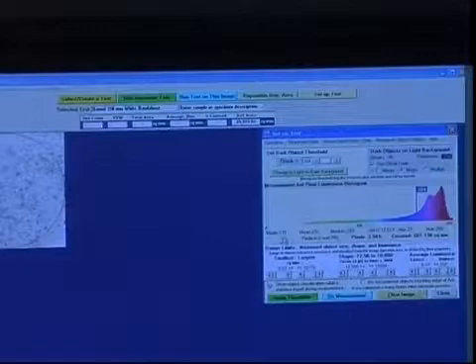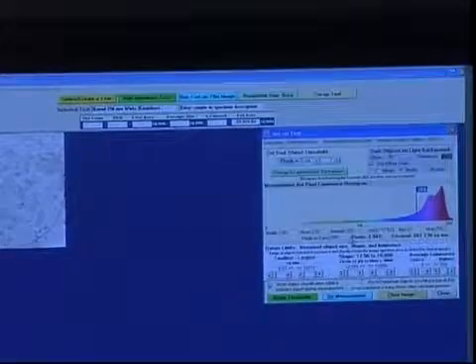And we will then set up the test further by designing the actual threshold. So you can see here that we have a threshold set of -35, about 15% of the background as suggested by TAPPI, and that is a threshold of 204. And we measured the background. We got the statistical mode, the mean, and the median.